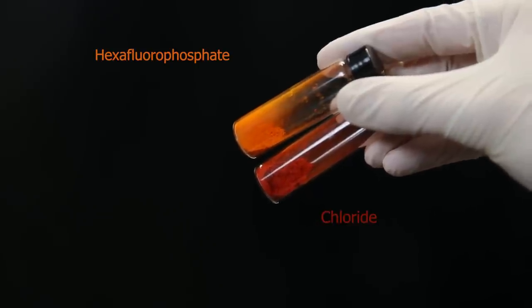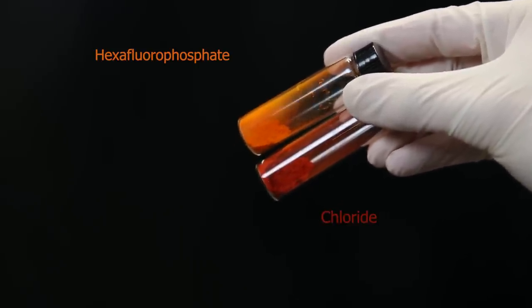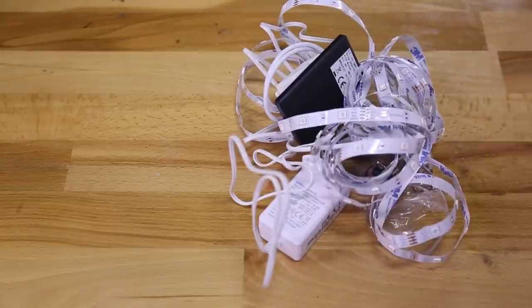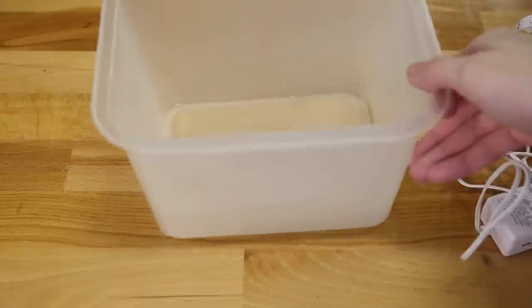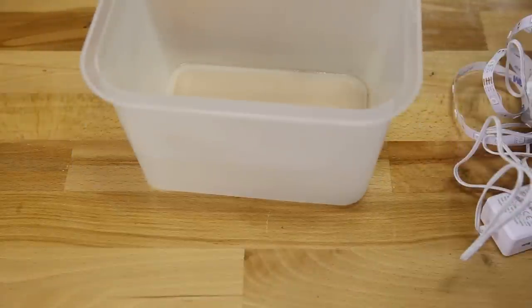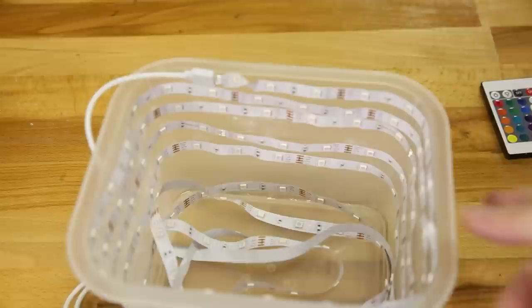Now that all of the reagents have been made, we can finally start the photoredox reaction. But first, I have to set up a reaction chamber to do the reaction in. So I thought of something simple and bought an RGB LED strip. And I also have this random container. My idea was to just stick the LED strip along the sides of the walls facing inward, and I can just lower the flask inside and wrap it in aluminum foil and do the reaction like that. So that's what I did, and when it's finished, it looks like this.